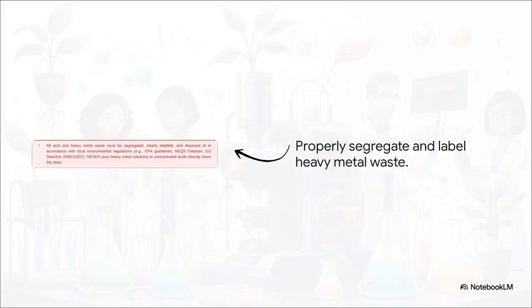And let's move to this final procedural step, because like any responsible forensic unit, the job just isn't done until the scene is cleaned up. All hazardous acid and heavy metal waste absolutely must be properly segregated, labeled, and disposed of according to strict environmental regulations, like EPA guidelines or NEQS standards. We literally never pour heavy metal solutions down the drain.